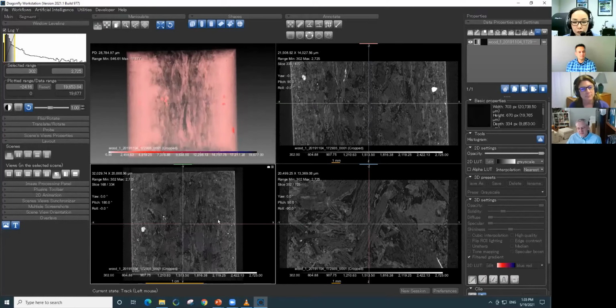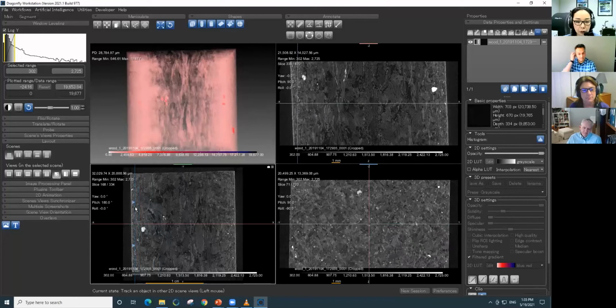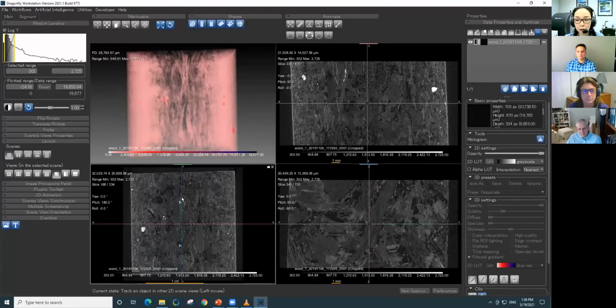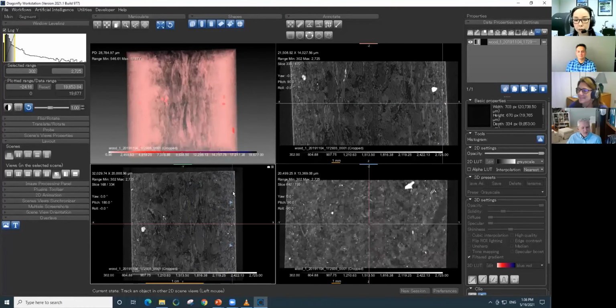This is a cross section of the wood frame. And if you go to the surface area, it's pretty thick or dense. This blue line is represented in this right bottom view. So you can see that there are a lot of wood fibers. This is very well packed, or high packing density. But if I go to the center area, you see a lot lower packing density. And it goes higher again when you go to this side.